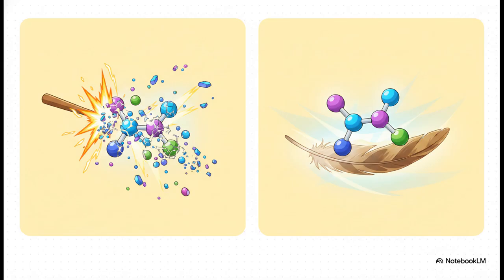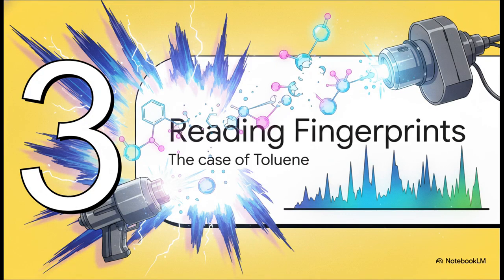On the other hand, we have soft ionization techniques, like electrospray or MALDI, which are often used for biological samples. These are so much gentler. They convert analyte molecules into the gas phase completely intact, without shattering them. Which brings us to section 3, reading molecular fingerprints. Let's look at the case of toluene.